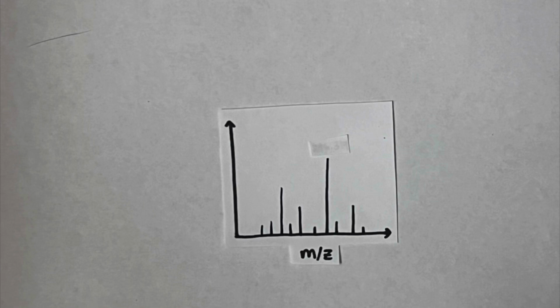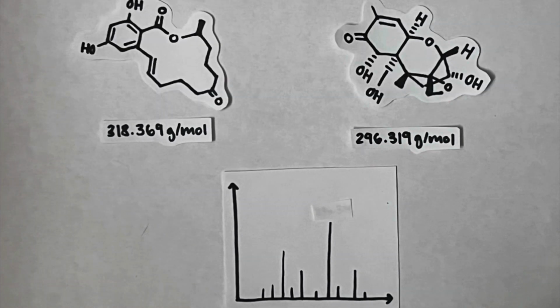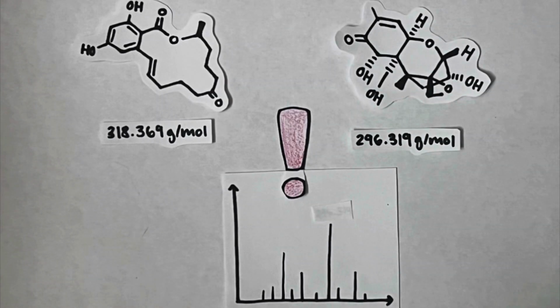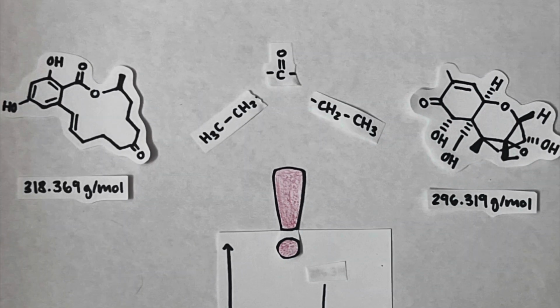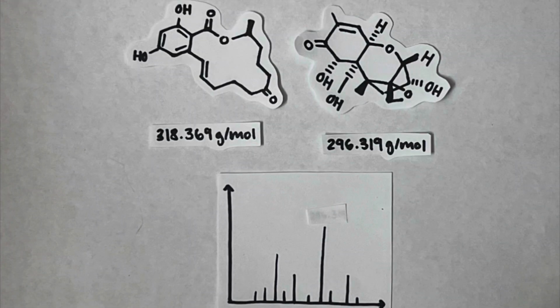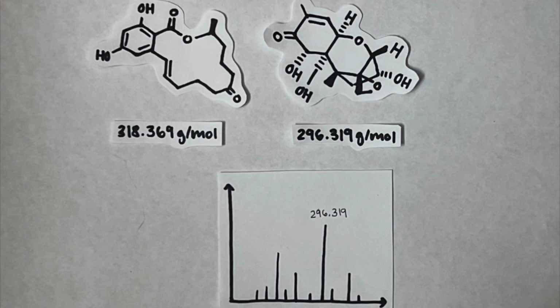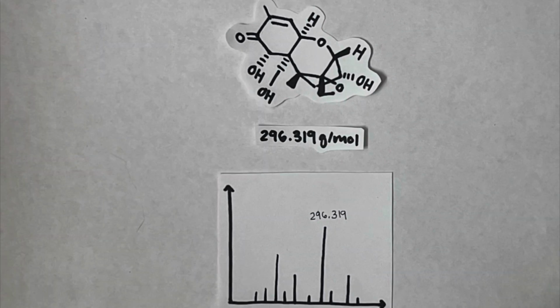Going back to our wheat example, we could compare the known molecular weight of our toxin of interrogation to our mass spectrum. However, in our creation of the unstable molecular ion, there's a chance of fragmentation, where our ion breaks apart into pieces. Knowing where your ion of interest could fragment and the molecular weights of those fragments is important for analysis. Thus, if we find a peak that corresponds with its molecular weight or its fragments, that would be a clear indicator that our wheat is unfortunately contaminated.